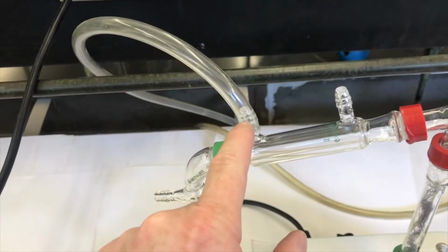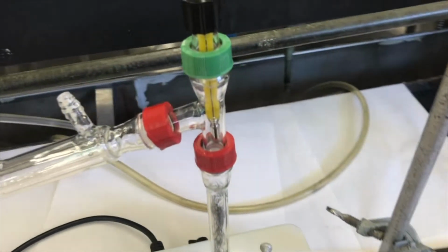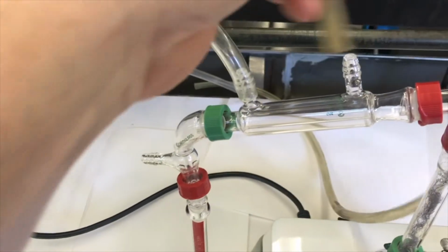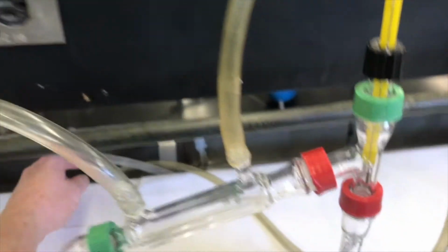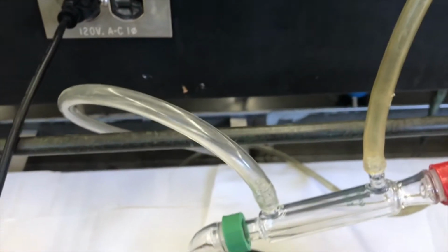Okay, I've got a nice tight seal here, and then I'm going to take another hose and hook it up to the top end. Here it is. I'll push it on better with 2 hands. And this other hose I'm going to lead to the sink, so the water's going to come out of the bottom of the aspirator, fill up the water condenser, and then drain out back into the sink.